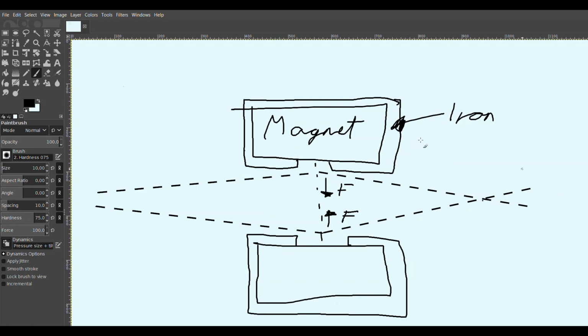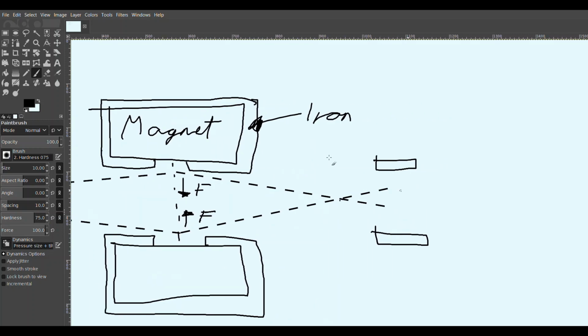So let's say you have a magnet beam here that makes it even smaller, and you later have a kind of special lens that makes the electrons very pointed and sharp at this point, and it points the electrons at different places on the very small object.